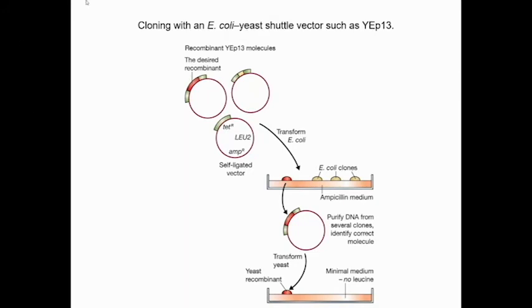So okay, so after the transformation to the E. coli cell, then you perform this antibiotic selection. Antibiotic selection.